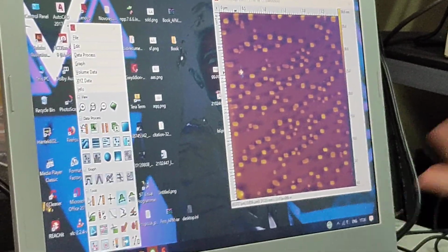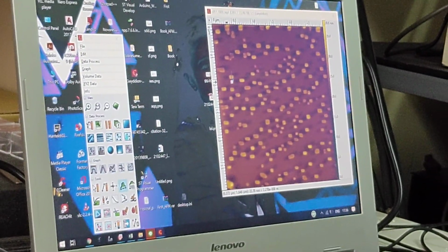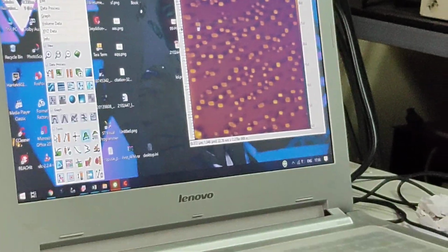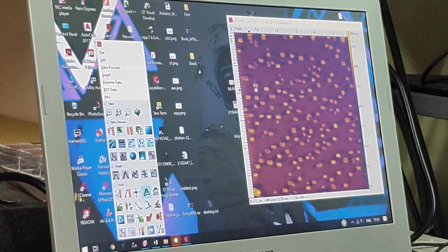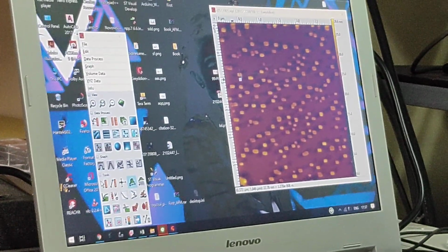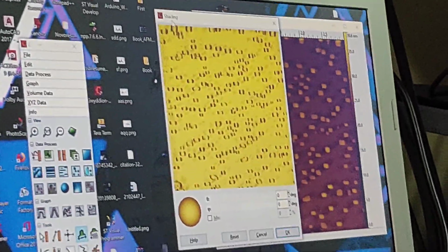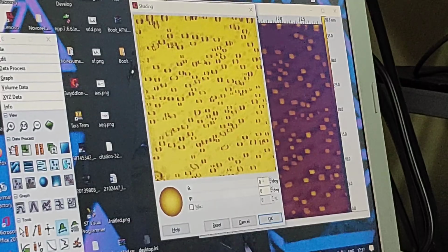And counting also, print out large. Blue, and this is the easiest. First, we don't have to do this, right? Yeah, we have only the surface. But you can show the AFM in 3D if you want. Okay. But here it's shading, not 3D. What? If I'm doing something here.